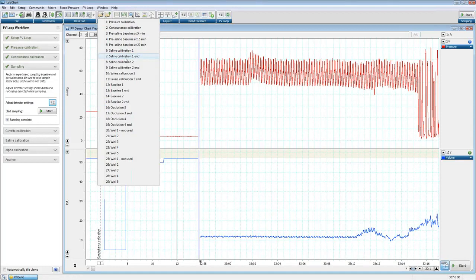And this is where it becomes very useful for workflow, because you know when you're supposed to do specific calibrations. What can you do with the animal? How do I need to prepare before I get to the step? It kind of gives you a nice outline to follow to make sure you don't jump ahead and not collect data that you need later on.